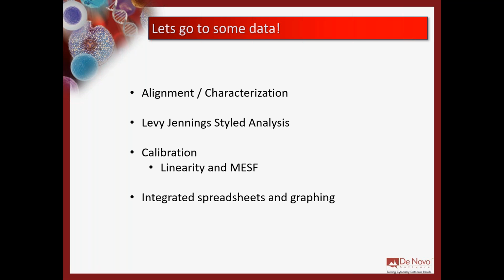So being able to go back and say use a known set of MEF or MESF standards and then calibrate your raw data to that, and not just taking a population level number of MFI, plugging that into a macro, but actually getting those results as you move gates, as you look at data. So the results that you're reporting in the software where you're performing analysis are already calibrated for you as you're looking at them. So this is all done through integrated spreadsheets and graphing.